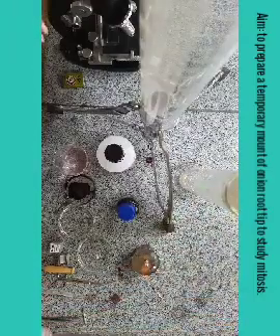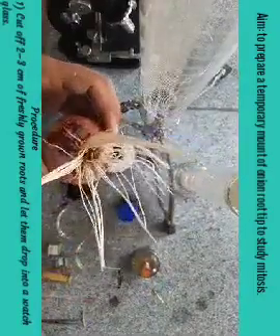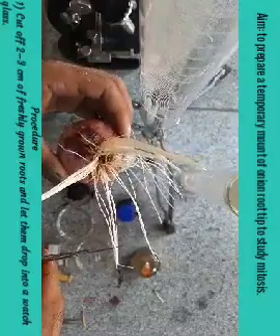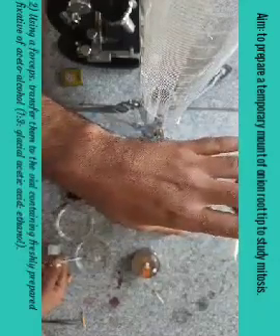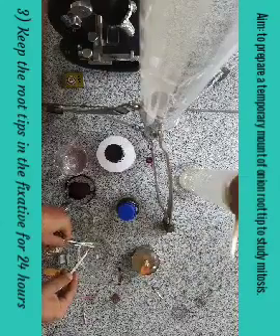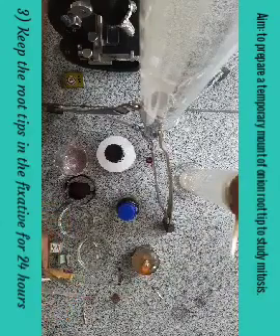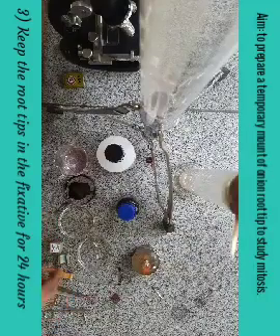Procedure: first, take the onion and scissors and cut about a few millimeters of root tips, like this. I have cut and put these root tips into the fixative solution, which is made of acetic acid and ethanol, and keep these root tips in this solution for about 24 hours. I have already kept some root tips since yesterday, so they are ready to be used for preparing the slide.